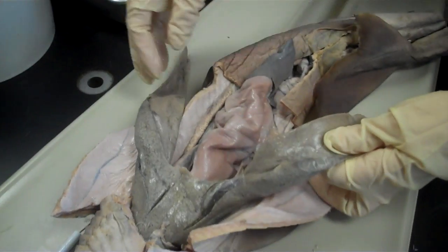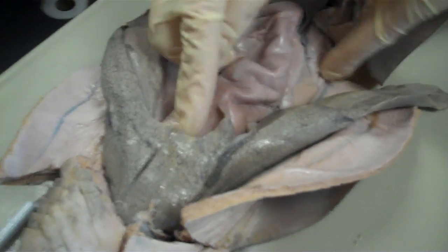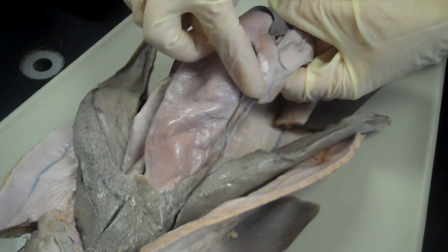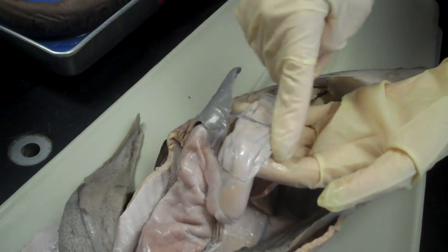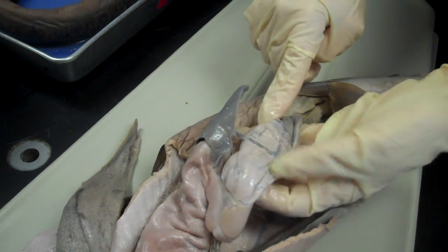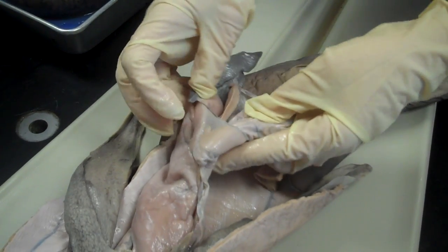So this is all liver. This is the gallbladder in the center. Here you have your J-shaped stomach. The base of that is the spleen. Stomach leads into the spiral intestine. Where the stomach and the spiral intestine meet, you find the pancreas.